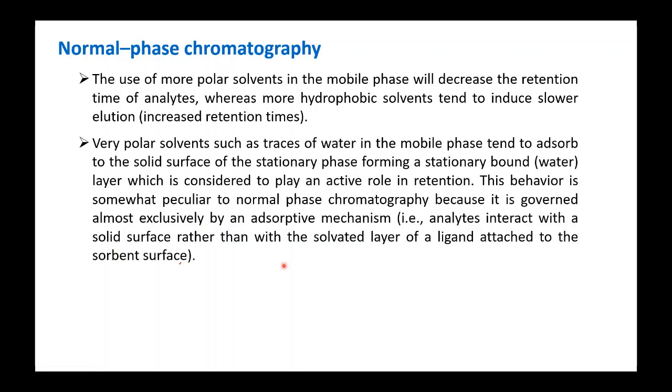Okay, so the very polar solvents such as a trace of water in the mobile phase tend to adsorb to the solid surface of the stationary phase, forming a stationary bound layer, which is considered to play an active role in retention. So you have a layer formation of the water on the stationary phase.